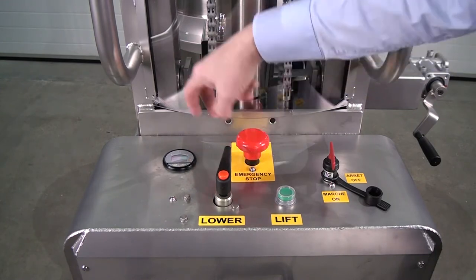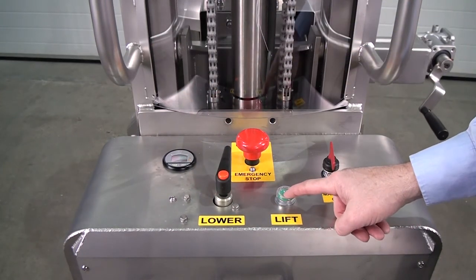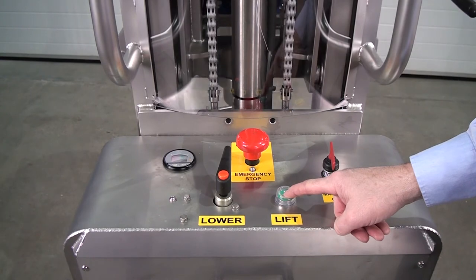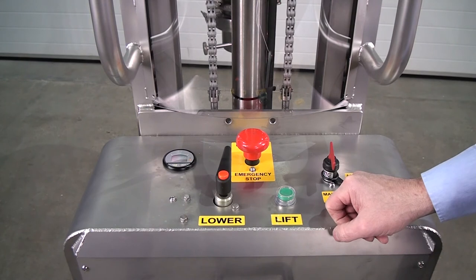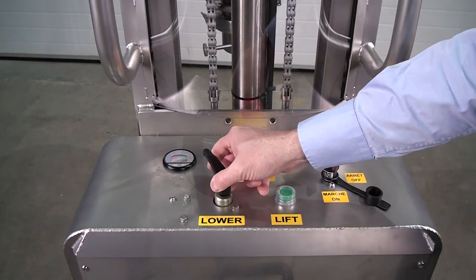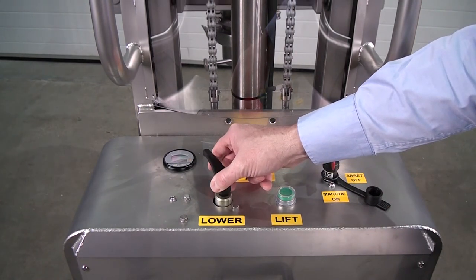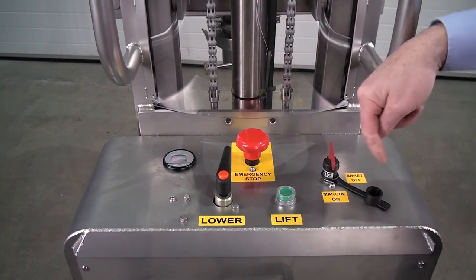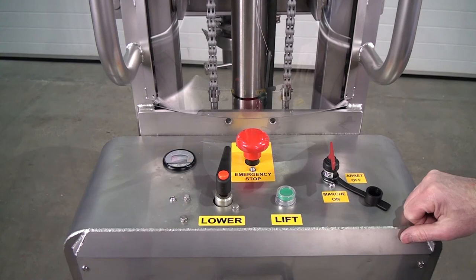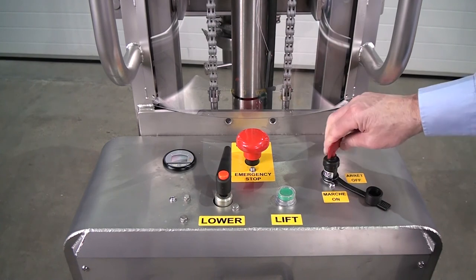Then we have the lift button. This is a set speed, but it's the lowering control we've adjusted to allow you to align the bars. On this side of the panel, just out of shot, is the charging connector. So when you're finished using the unit and you're going to leave it for any length of time, switch off the power key.